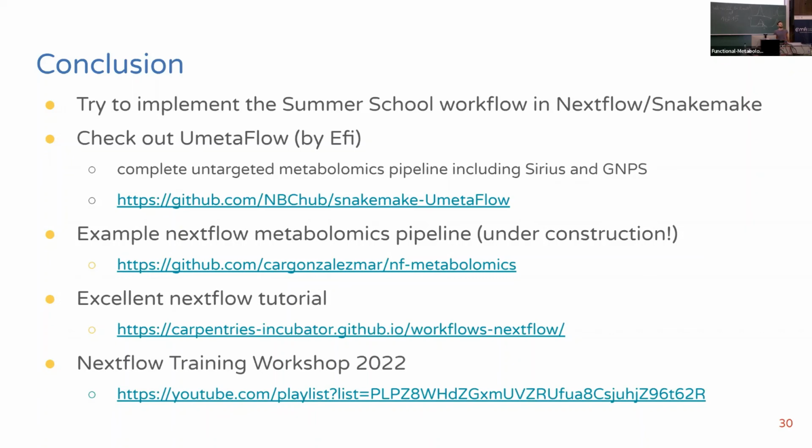Is there a good community for these kinds of things? People putting it on GitHub? Yeah. I can just pull it from GitHub, because I have no idea what you just did, but I probably could work it out if I stared at it long enough. Yeah, and use it. NF Core is the way to go there, I would say, because the workflows are so well documented and easy to use that you don't need any special knowledge to execute them. And you could learn from that as well to build your own. If you had a question.